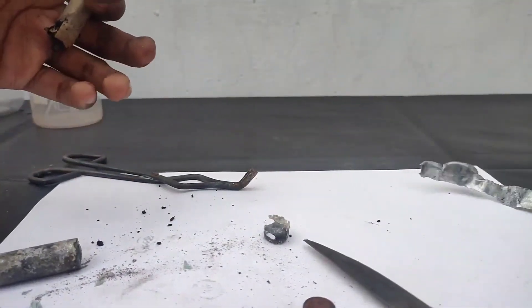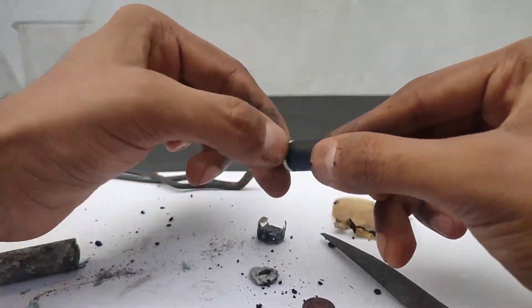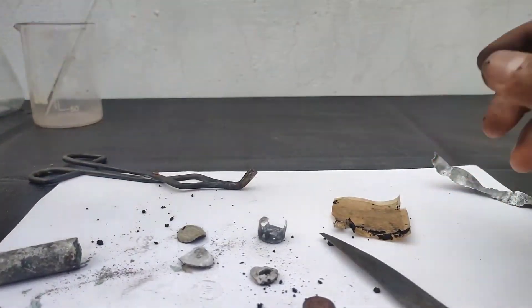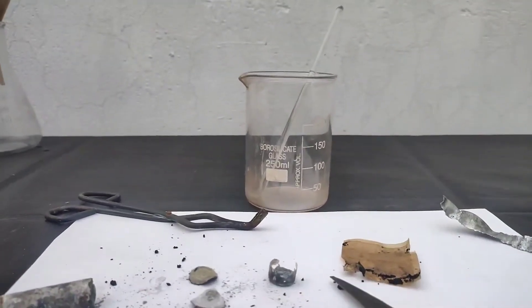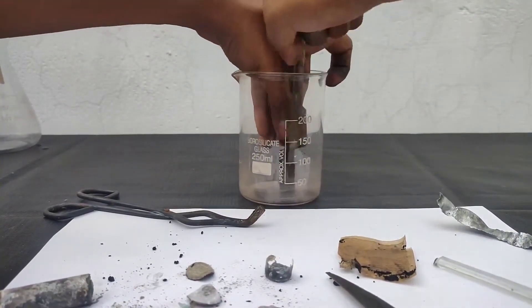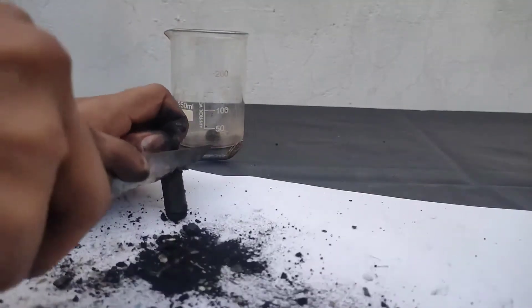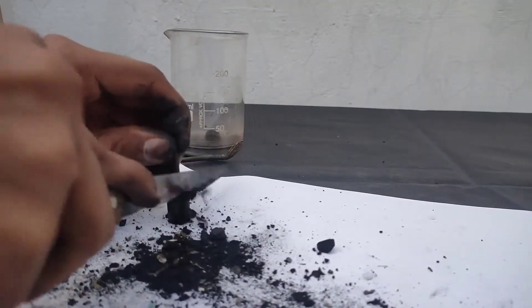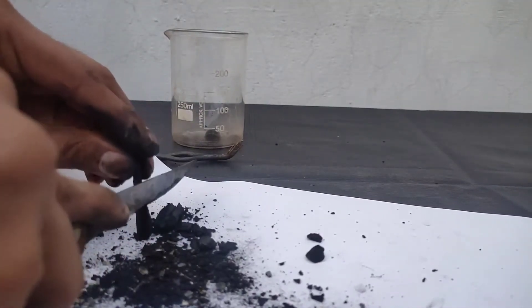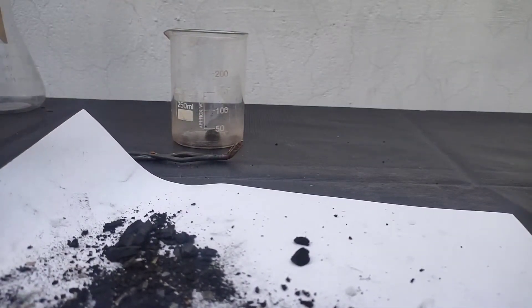After removing the zinc, I kept it aside. This is the black manganese dioxide mixed with some charcoal and other soluble electrolytes such as ammonium chloride and zinc chloride. I have opened up both cells and taken out all the black powder. The graphite rods I also kept aside, which will help me in electrochemistry experiments.